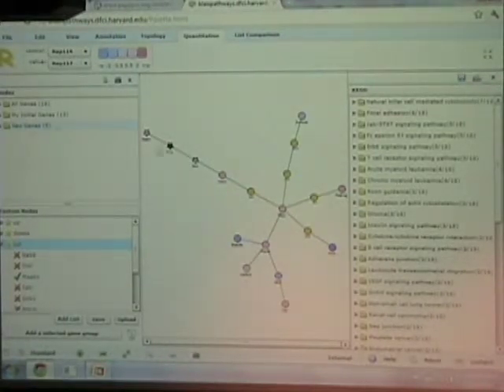So if we go to, for example, this gene and underlying protein, we're claiming here that the 117 reporter ion is much greater than the 116, meaning this is a phosphosite that is much more upregulated in the D835I mutant versus the ITD mutant in FLT3 receptor. So I would like to look at that more carefully.